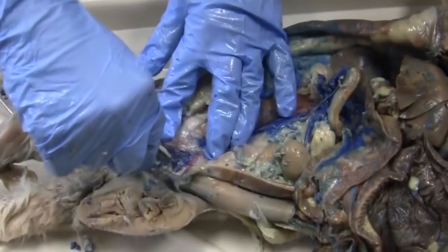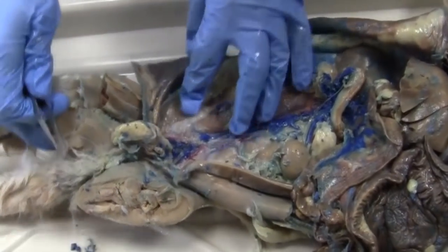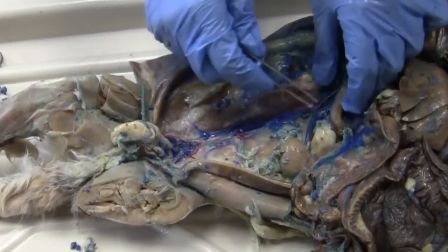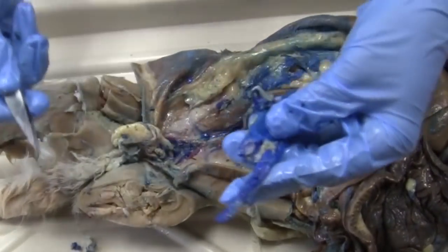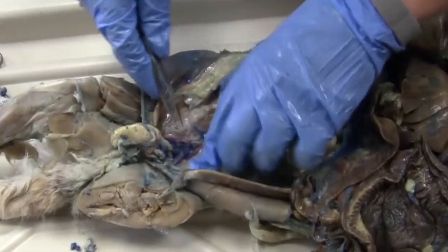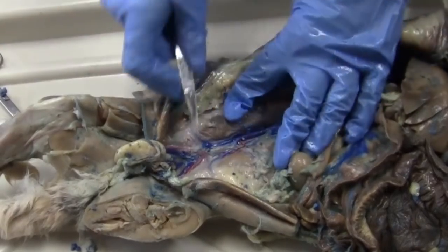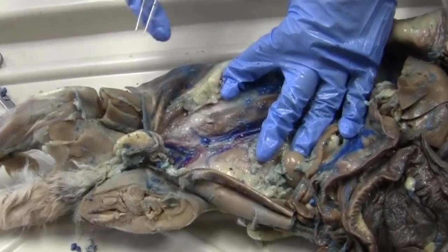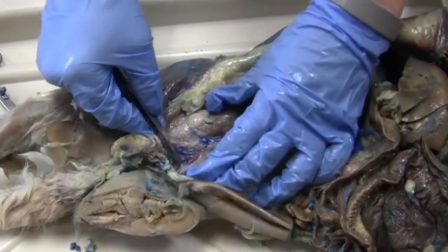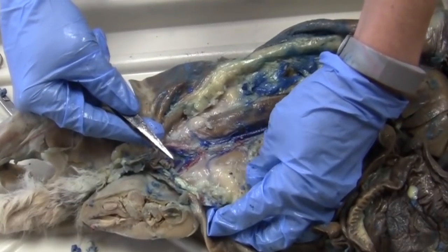The vein exploded a little bit. This blue stuff is actually a blue plastic dye. So when it explodes like this, all of this is a hard, flexible plastic. As these arteries and veins split here in the bottom of the leg, once again, they're going to change names. So we have the external and the internal iliac artery and veins.